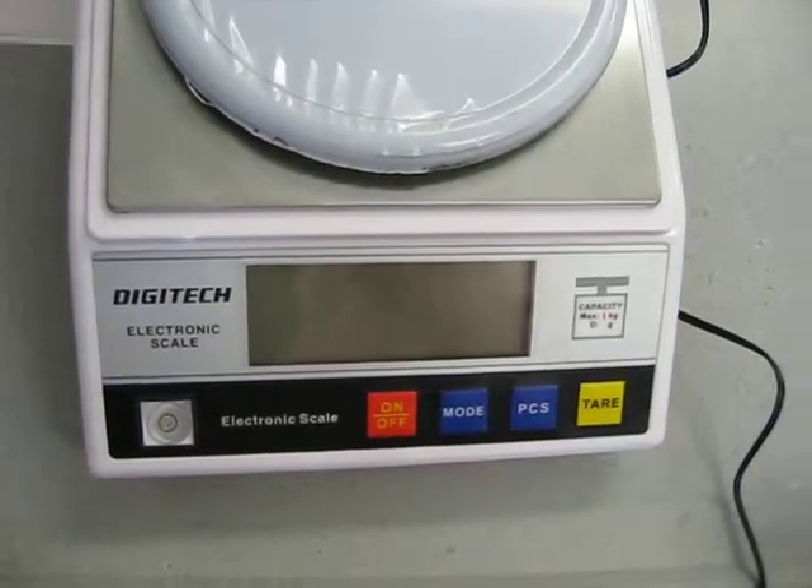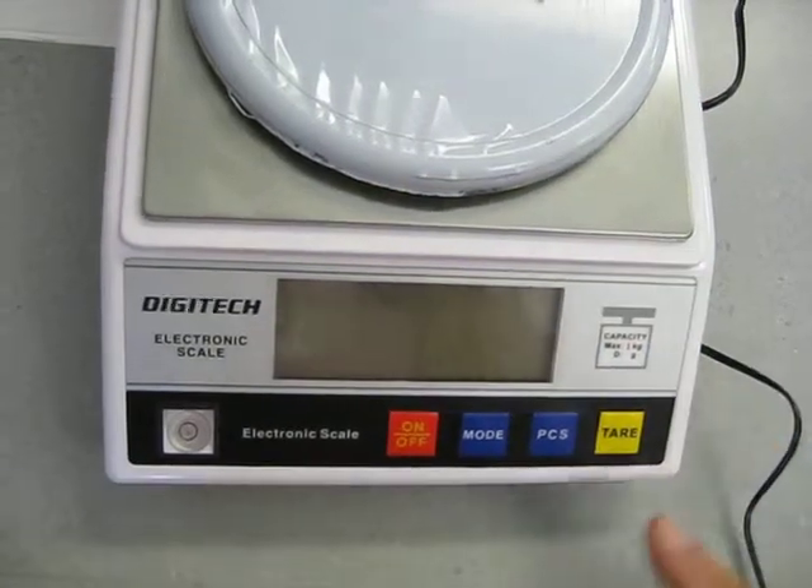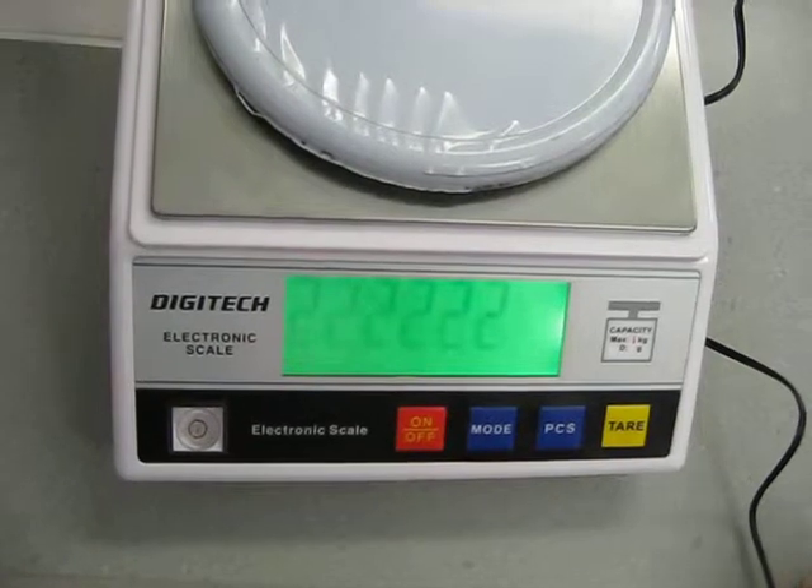This is how you use a set of scales. First, you turn it on — that's pretty easy. Wait for it to come on.